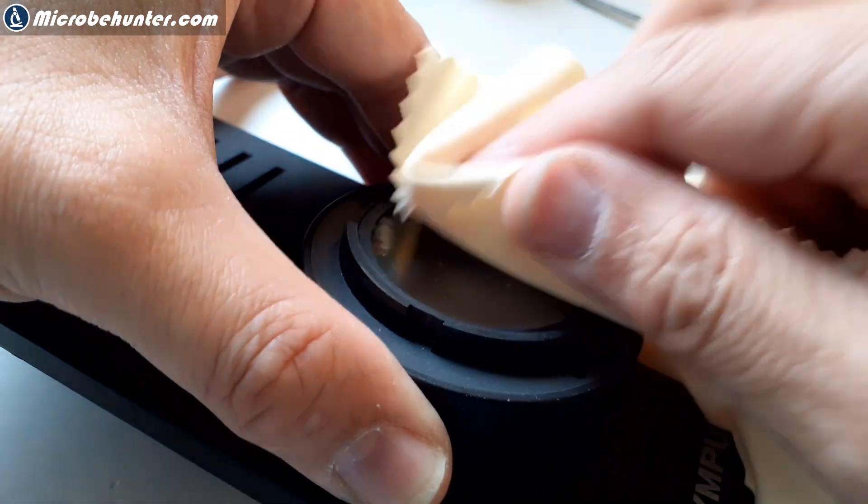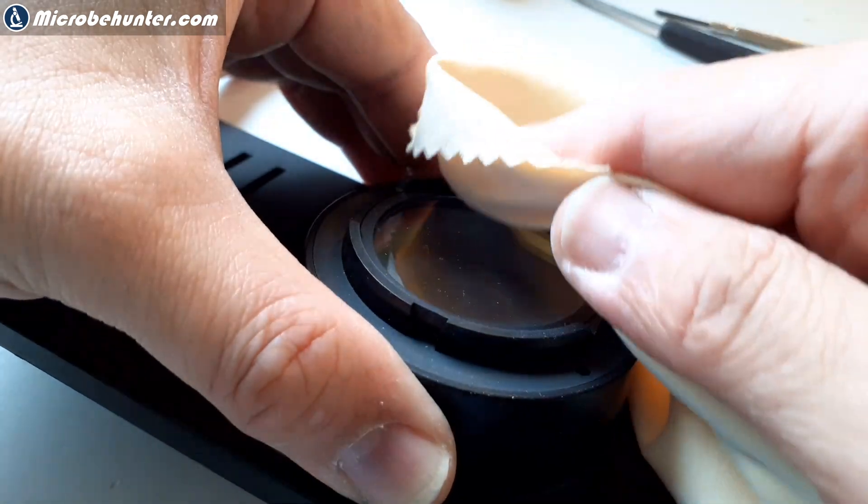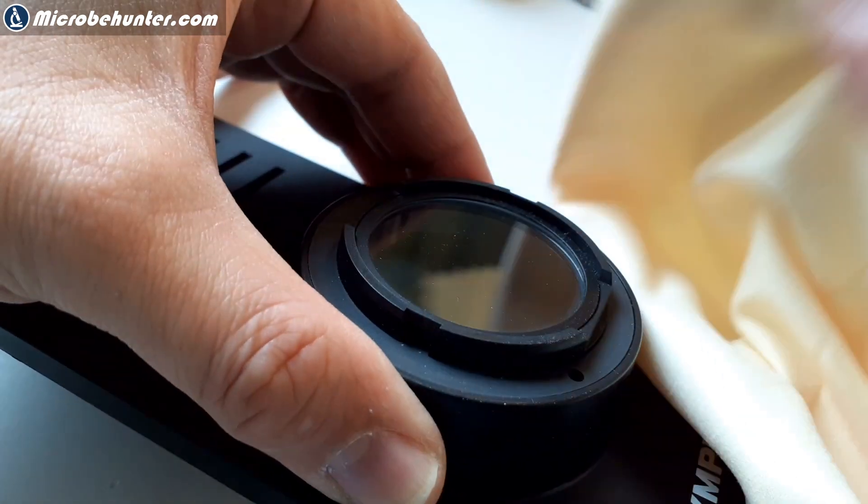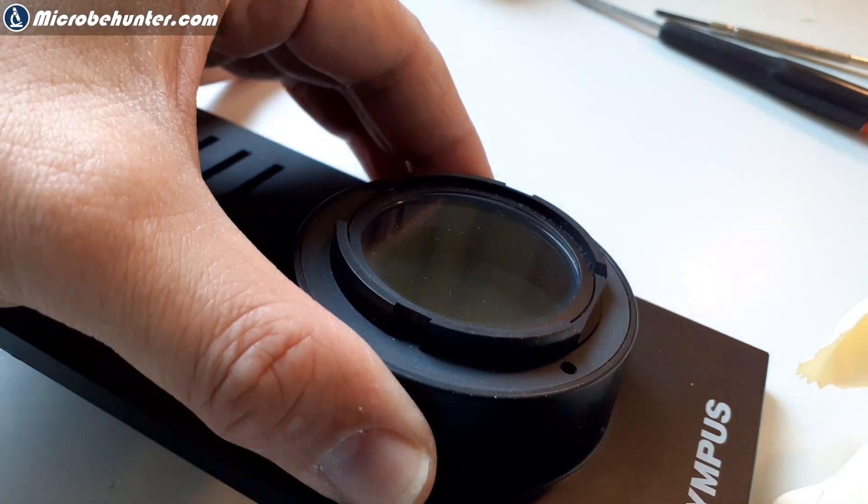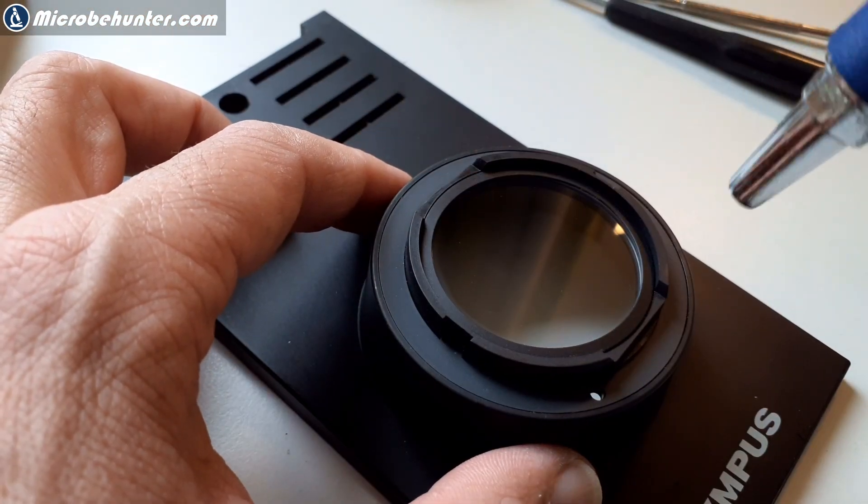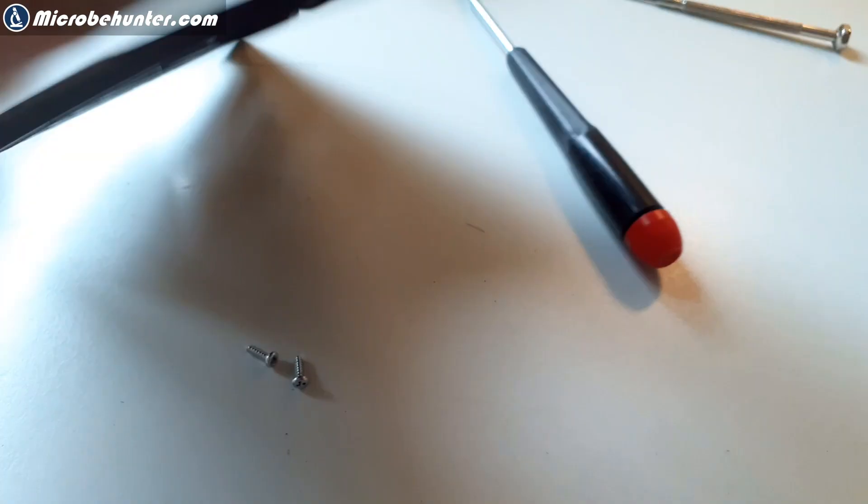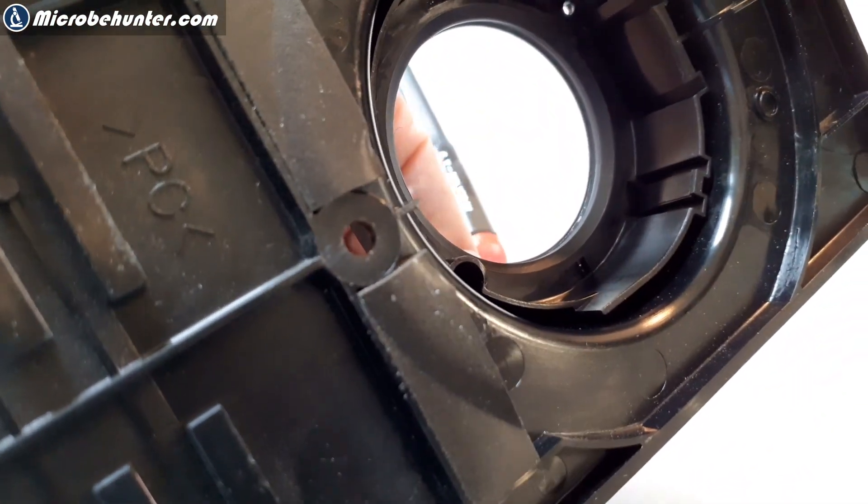So I gave it another clean. Afterwards, I again assembled everything again. I was happy that this actually solved the problem. So even if your microscope is constructed differently, I think it's a good idea every now and then to take apart everything and to give it a nice little clean.